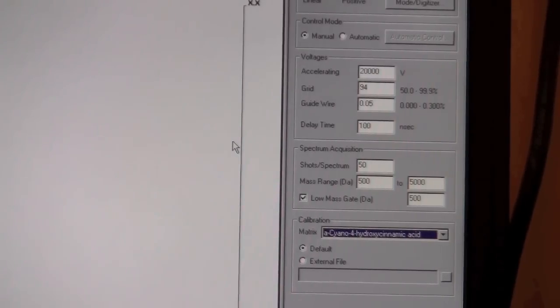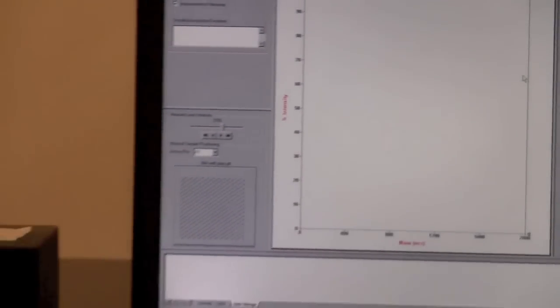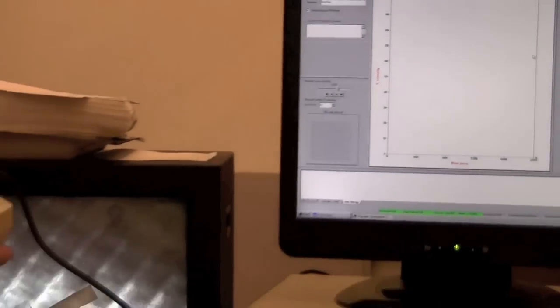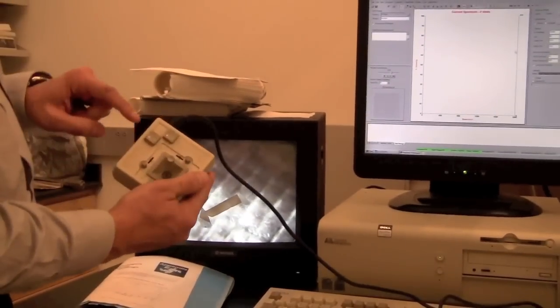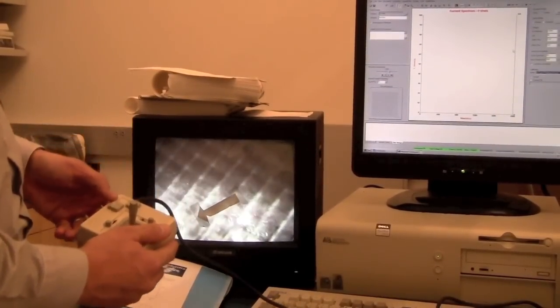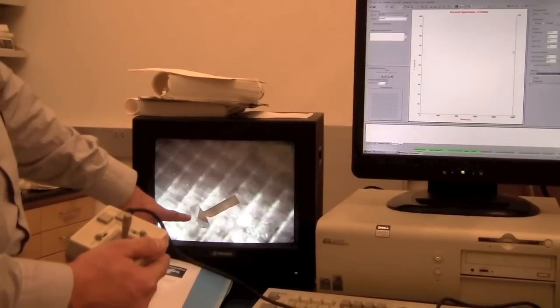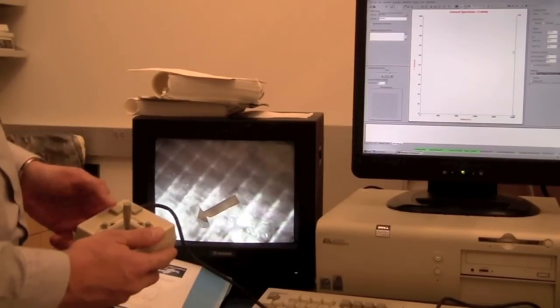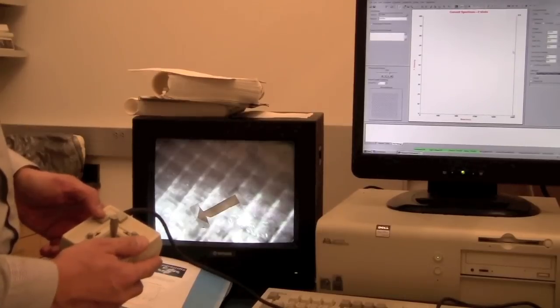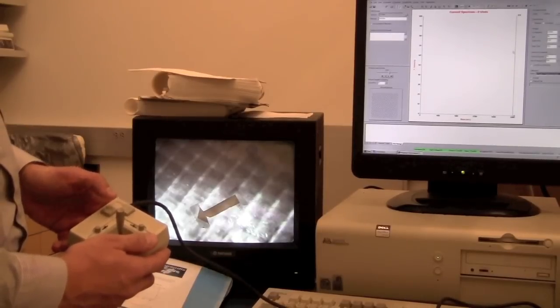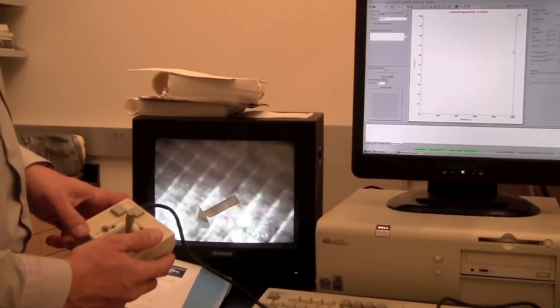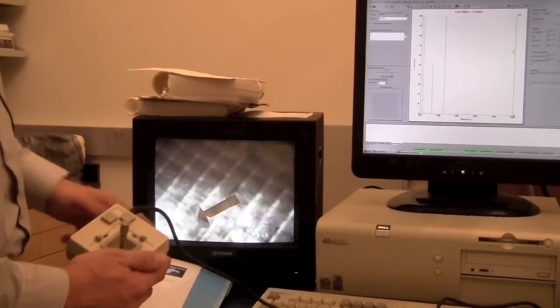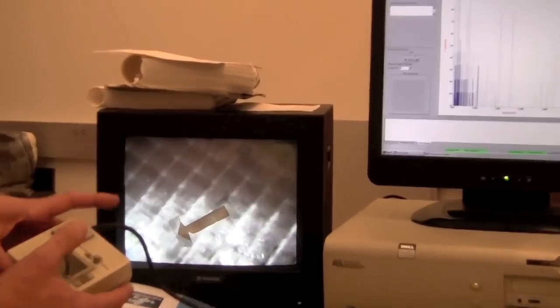In this case, I'm just going to leave everything as it is and I'll show you how to operate the instrument. We'll come back to the joystick, assuming everything's ready to go on the software. And to start collecting data, we hit the fire button, which is this one, and it will start shooting the laser. You can often see a flash here where it's firing the laser. So I'm going to do that now and it will start firing the laser. That's where it's firing.